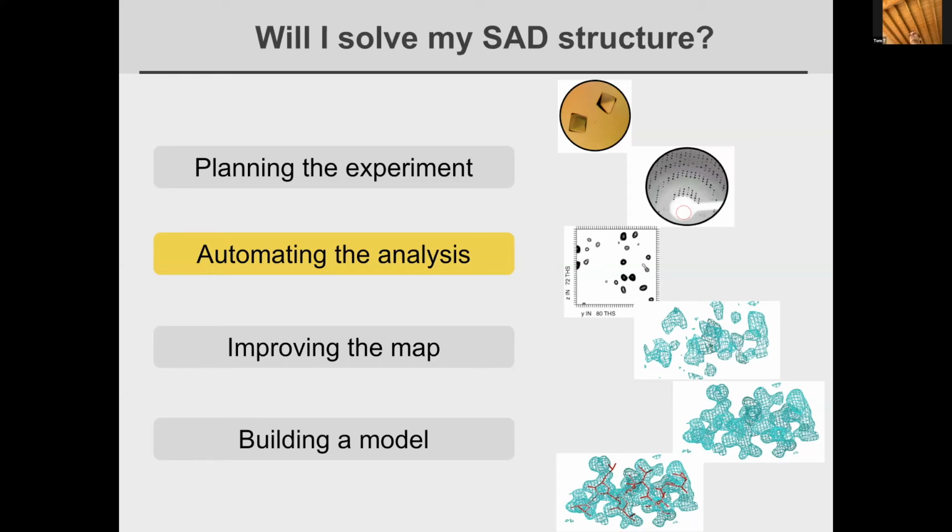And I over sigma and percent error are kind of the inverse of each other, right? So if you have an I over sigma of 30, then your percent error is going to be like 2 or 3%. And so you want a small percent error or a big I over sigma. Those are the things that you're looking for. And so when you collect your data, generally you're going to get a little table that shows as a function of resolution what the I over sigma is, or the percent error as a function of resolution.